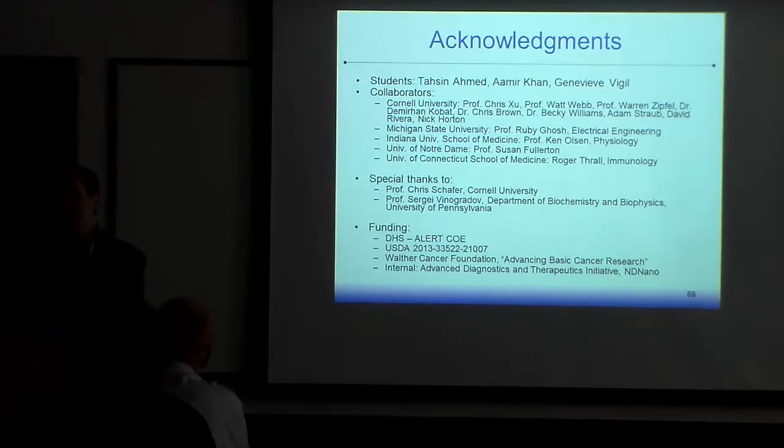Oh, so you mean dispersion and all that stuff? Yeah. This was one of the big problems with the endoscope. She's asking, how do we compensate for the difference in wavelengths? We have all these optics in there that are basically sitting in infrared light and then focused down to a point, and then we have visible light coming back.